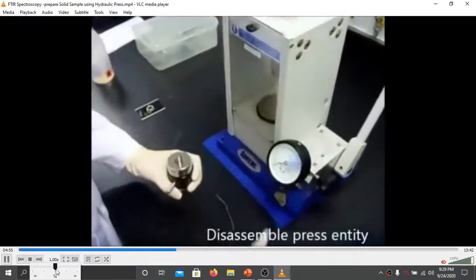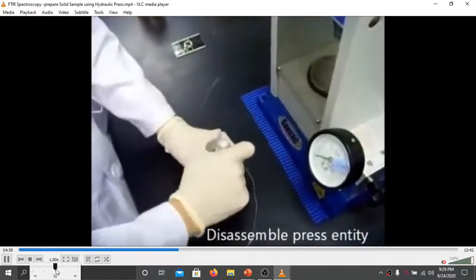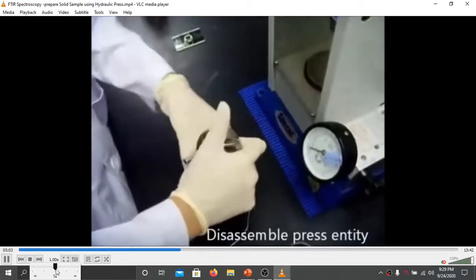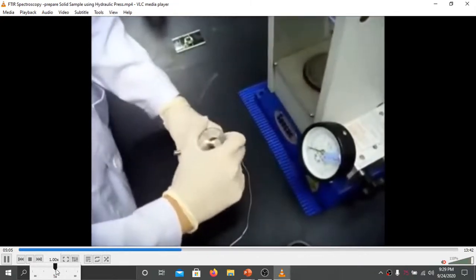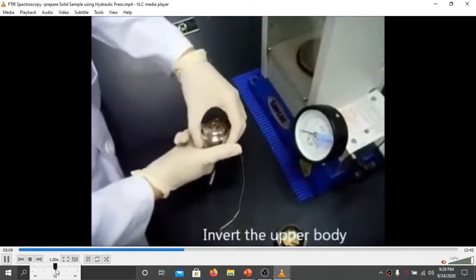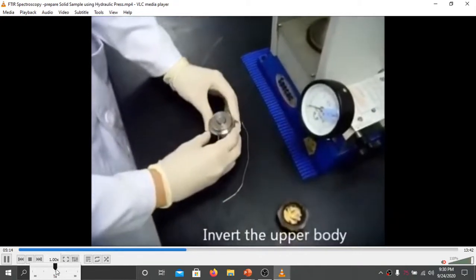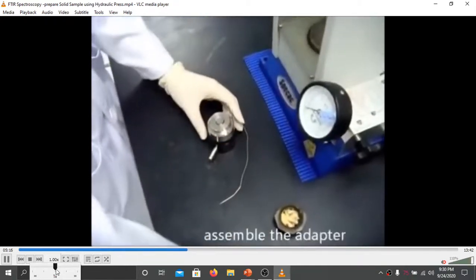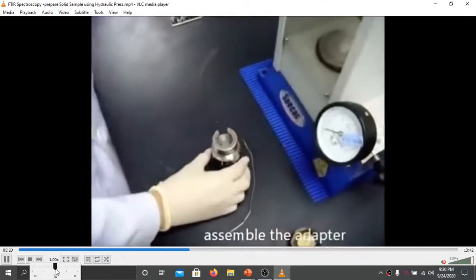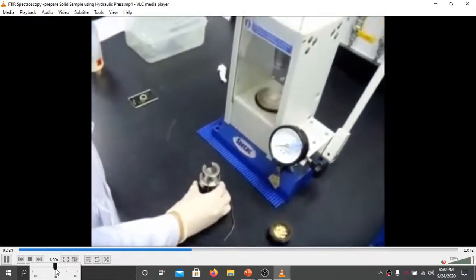Remove the upper part from the bottom part by rotating slowly. The die is in place and it is kept inwardly into the base, and an adapter is assembled so that by applying certain pressure, the pellets will come out.